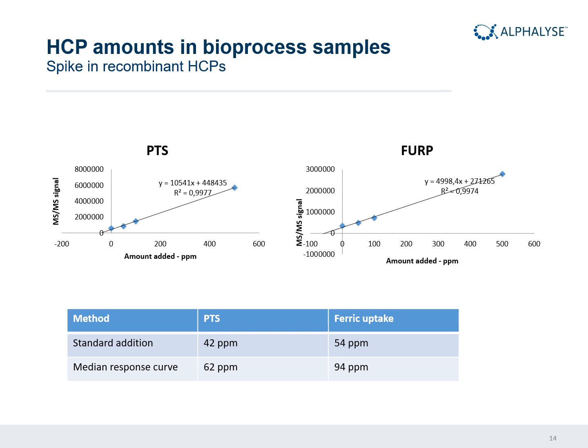We have verified the results we get from this absolute quantification using the sum-all approach by having a real sample where we were able to have 2 host cell proteins produced recombinantly, so that we could spike those 2 proteins into a sample, and thereby get this kind of signal or slope.